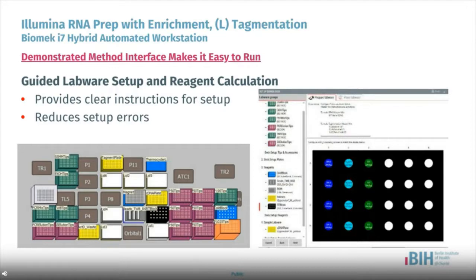After the user has selected their run parameters, the guided labware setup provides a graphical interface to assist with deck setup, including the required number of tips, consumables, and calculated required reagents. This setup is dynamic and will change according to user input parameters, so that unnecessary reagents or labware will not be shown during the course of the run.